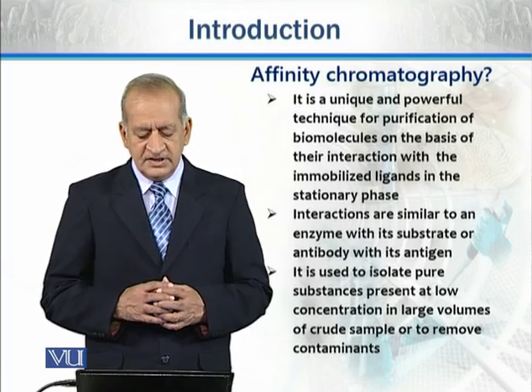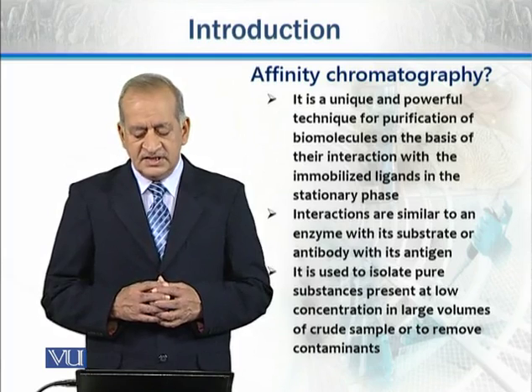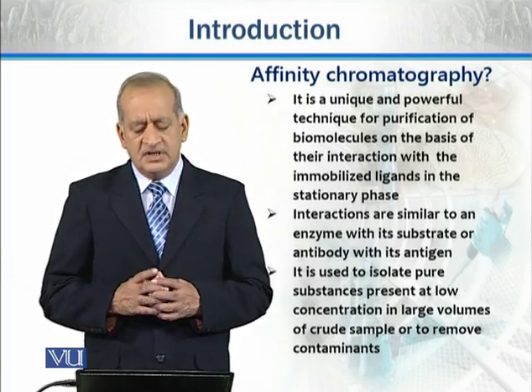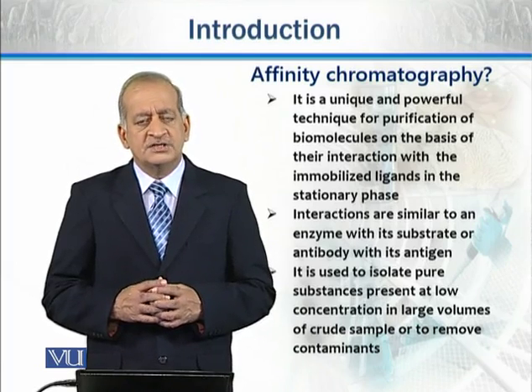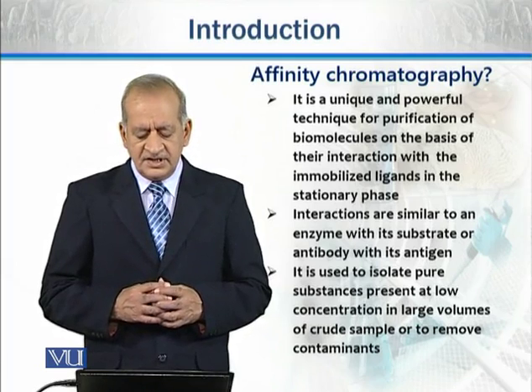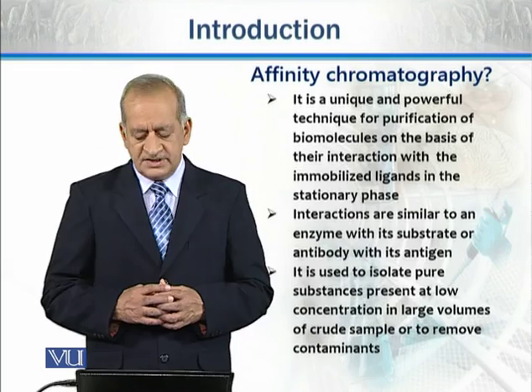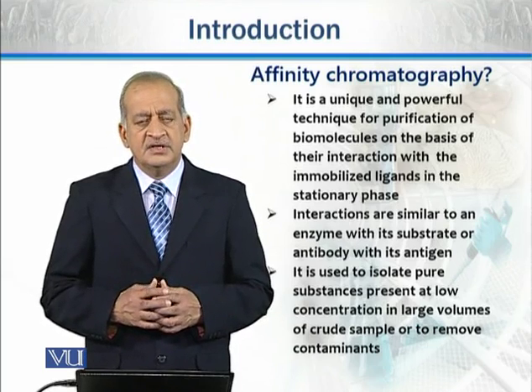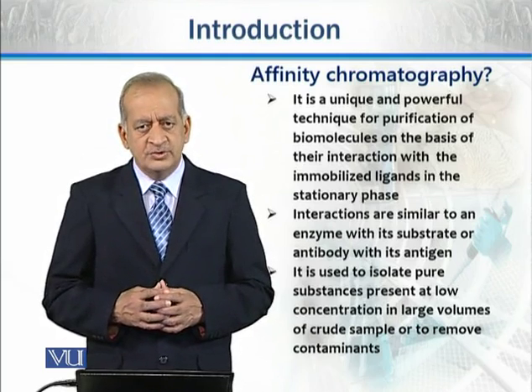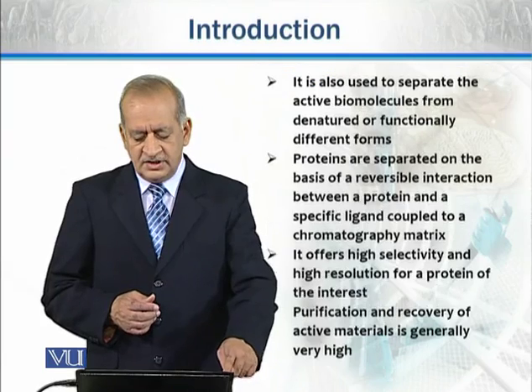the stationary phase. Now, interactions of these biomolecules with the ligands are similar to when an enzyme is bound with a substrate or an antibody is bound with an antigen. And this technique is used to isolate pure substances present at low concentration in some large volume of crude sample, or it is also used to remove the contaminants present in the sample.